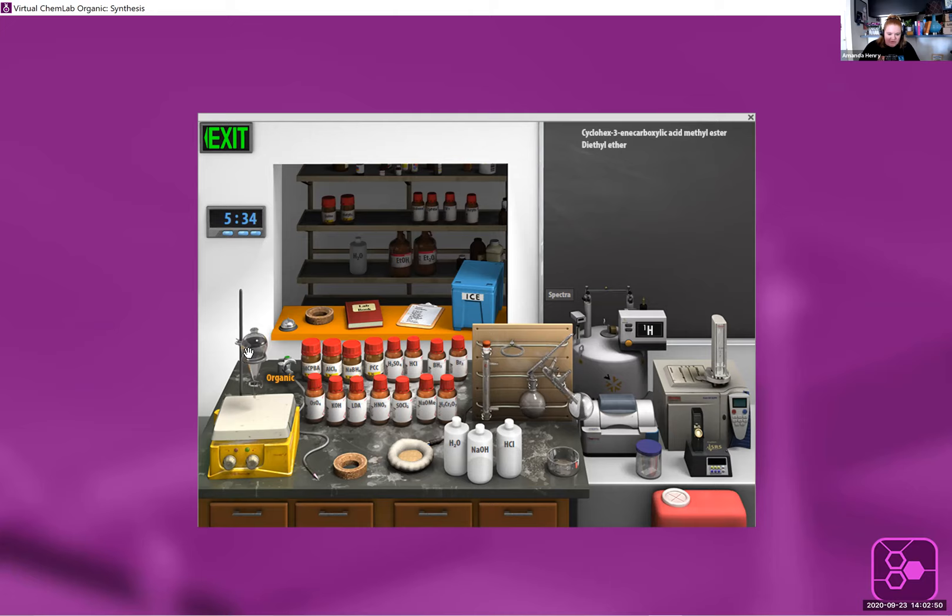We'll do just a water wash. So we've added the water. Right now where my mouse is, I'm in the organic layer. The chalkboard is telling me it's my product and ether. And if I just move my mouse down, it's the water layer. I'm going to click and drag on this one, and when you do that, it just takes the ether out of it for you. If I put my mouse right here on the chalkboard, it's just the product.